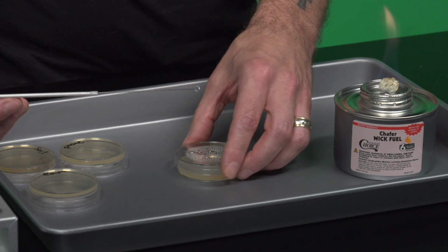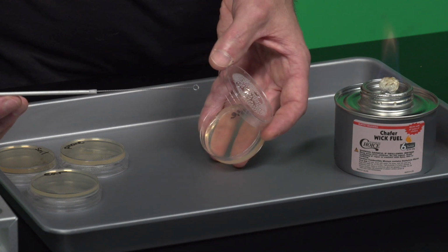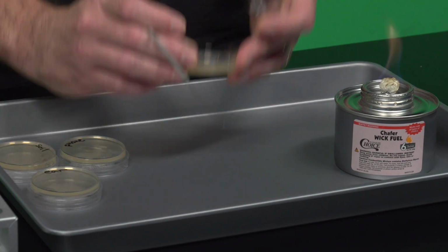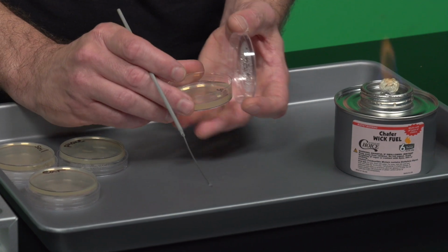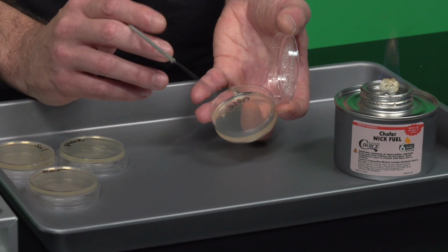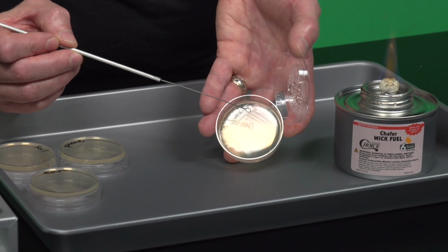While it's cooling, I'm going to get my bearings and make sure that I can see where that quadrant was. For me, I can see it. It's kind of hard with these lights in here. There we go. Right there, this is quadrant 1.